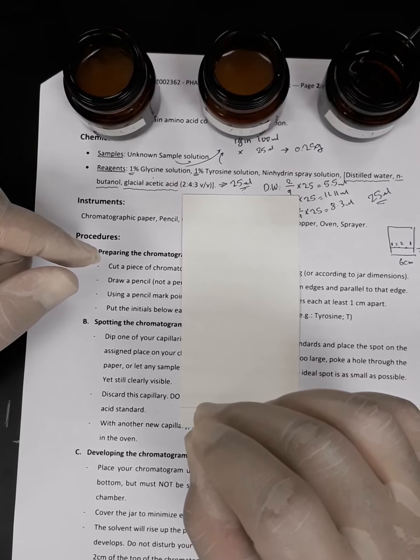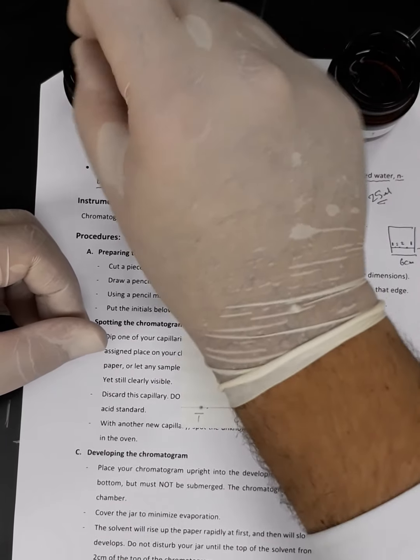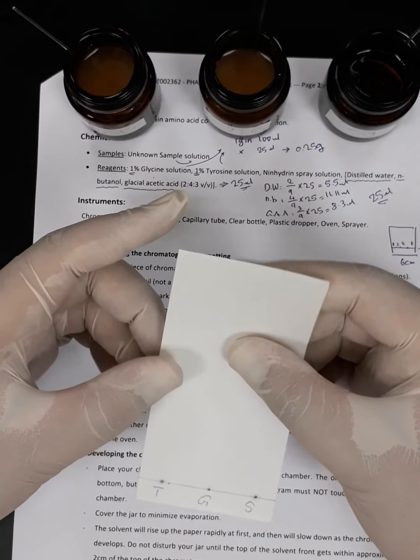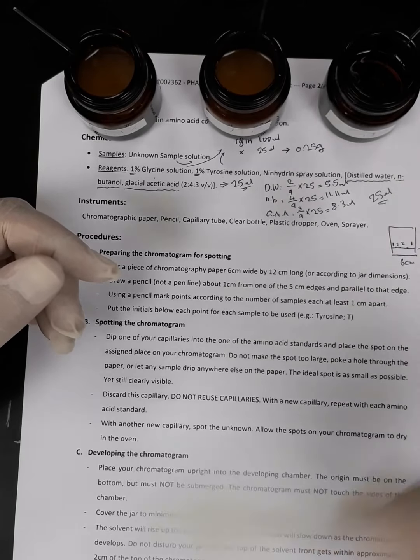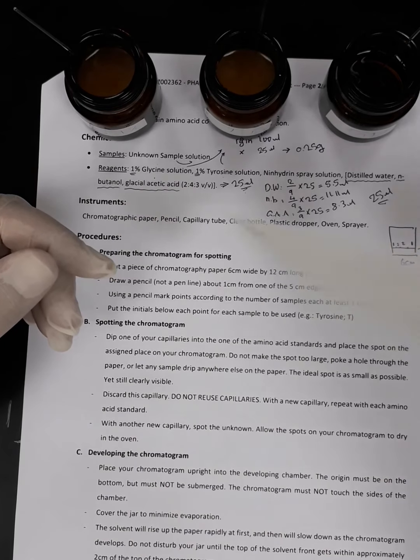Now I'm going to take another capillary tube and I will take one drop from the tyrosine and I will spot it on the tyrosine here. And I will take a new capillary tube and I will take from the sample solution and I will place it on the sample. Now I loaded the 3 spots. This step we call it loading, and I will dry the spot so I will get rid of any moist content. So I'll just have to do that till the spots become clear.